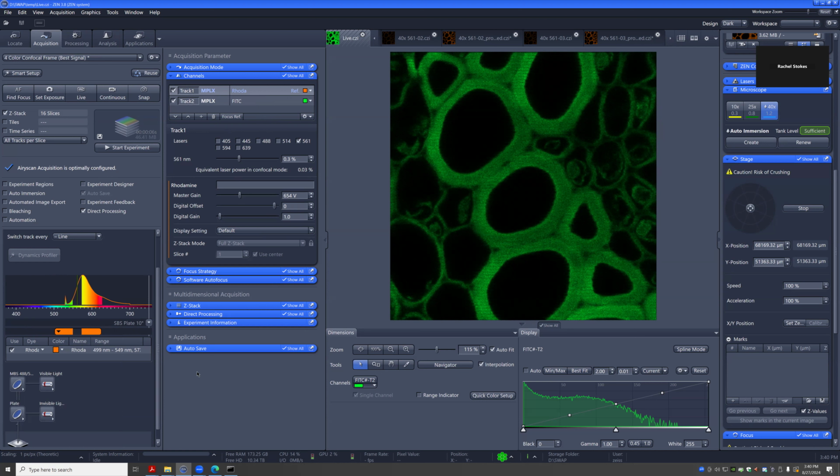So as you said, if we choose the full Z-stack, better to do full Z-stack per track. Honestly, you want to do that in Z-stack frame mode. There's a couple extra options when we have Z-stack selected. Generally, I don't pick these things here. I pick smart setup and pick my settings there. Maybe I'll pick my drop down here. This will do exactly the same. See, if I pick Z-stack here, it'll auto change this here.